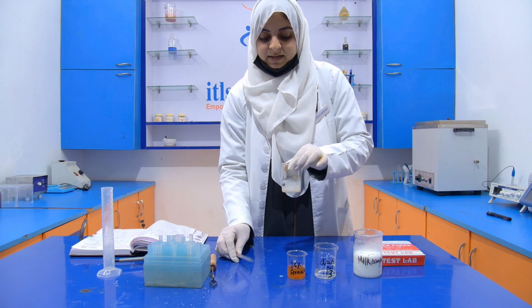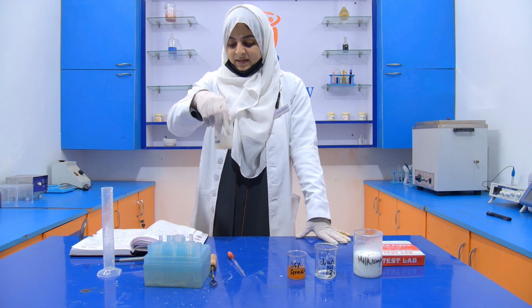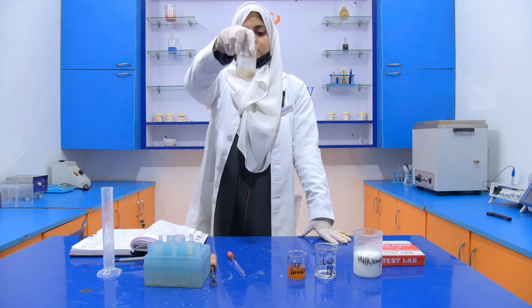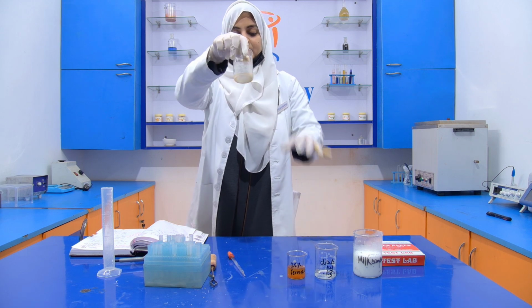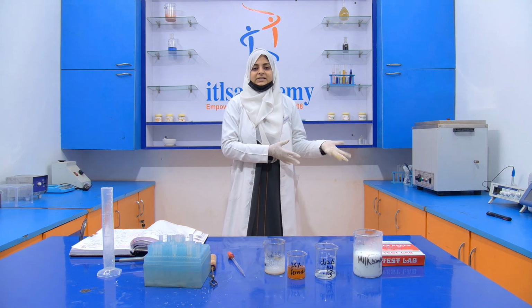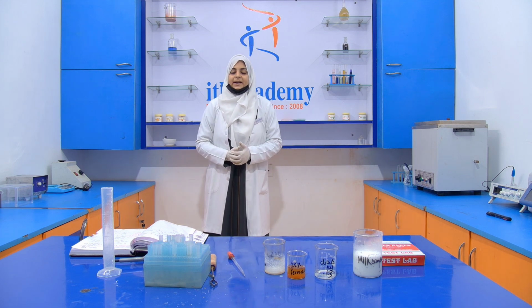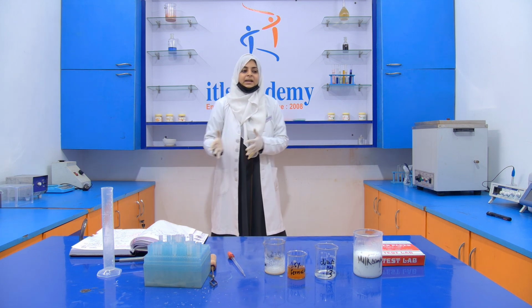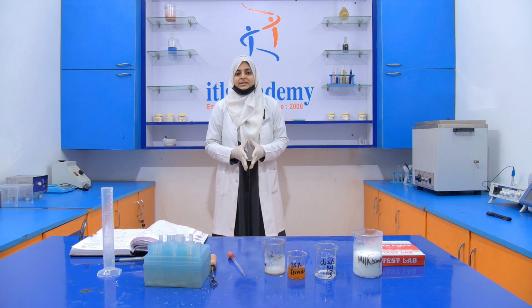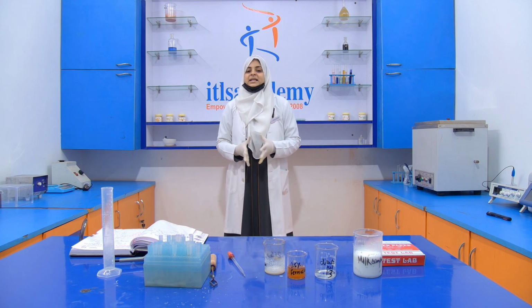If benzoic acid is present, then this solution turns pink, and if salicylic acid is present, then this solution turns violet. So see that the solution does not turn any color, it is white in color. That means that our sample does not contain any benzoic acid, benzoate or salicylic acid. If it turned pink, then it indicates the presence of benzoic acid or benzoate, and if it turned violet, then it indicates the presence of salicylic acid. So this is all about the detection of benzoic acid, benzoate and salicylic acid.